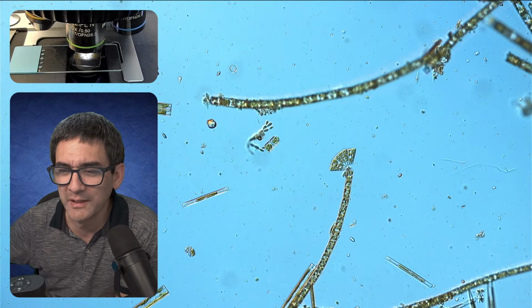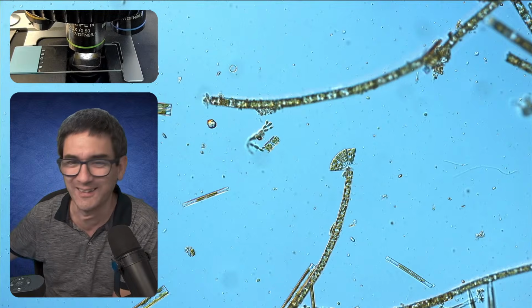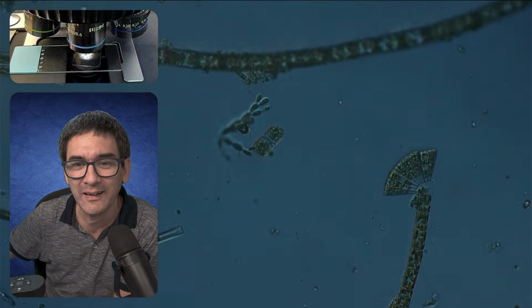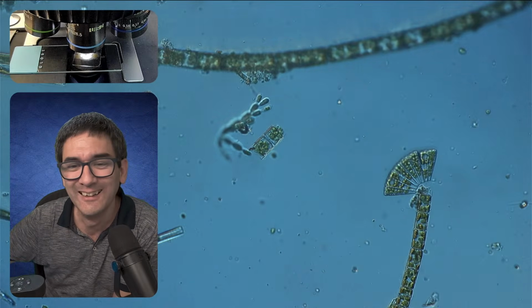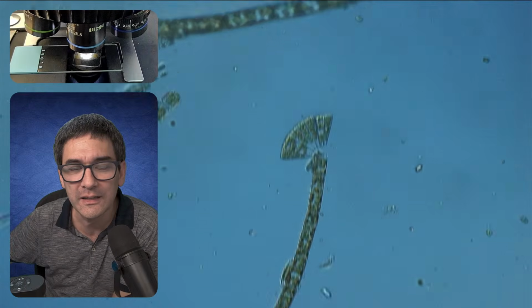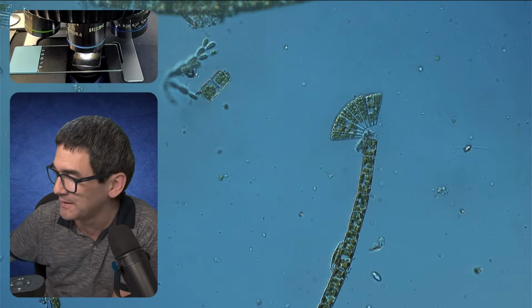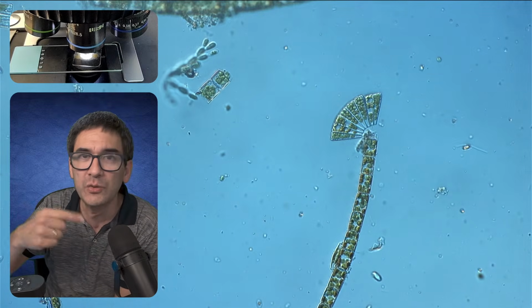Worried about cross-contamination, but still wiping his nose with a tissue he used for cleaning the tweezers. I will tell you the following, but I'm not so worried. I was cleaning the tweezers first before wiping my nose. The thing is that those water samples are always in continuous exchange with the environment anyway.